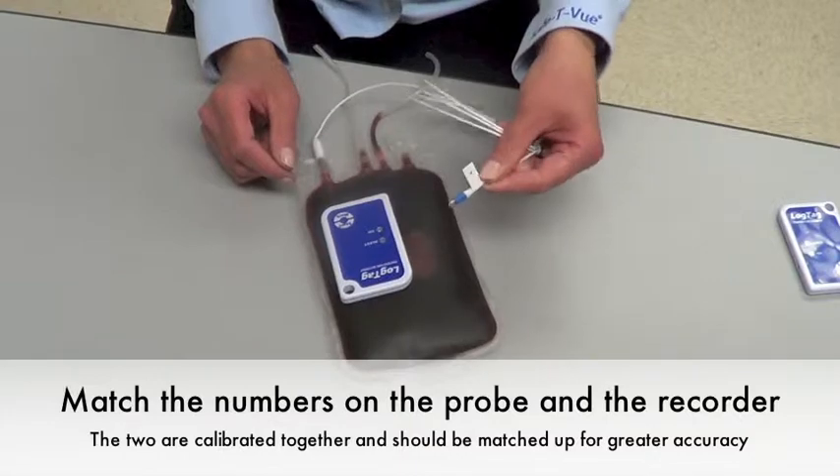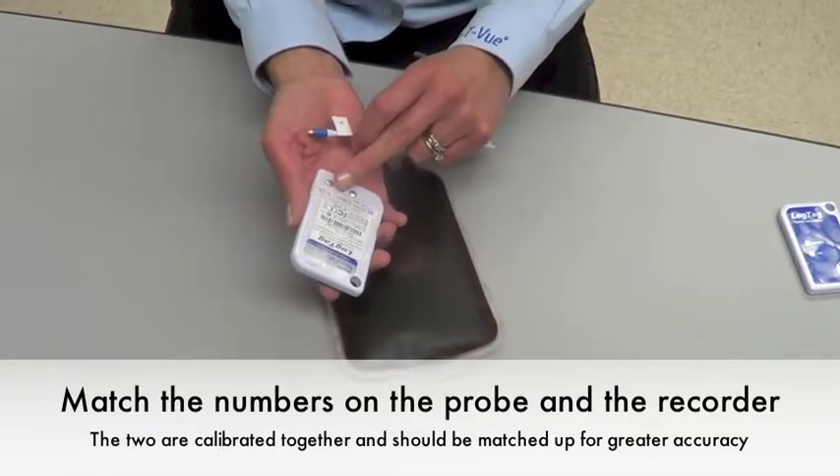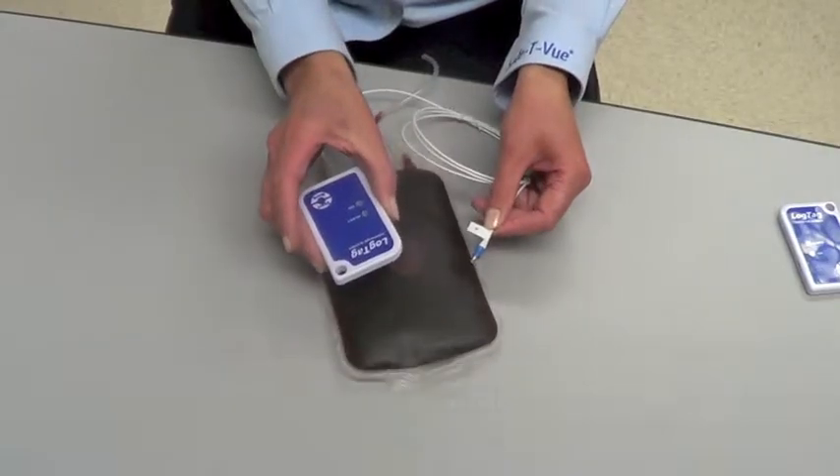Make sure that the number on the bag sealer probe and the number on the temperature recorder are the same, because they are calibrated together.